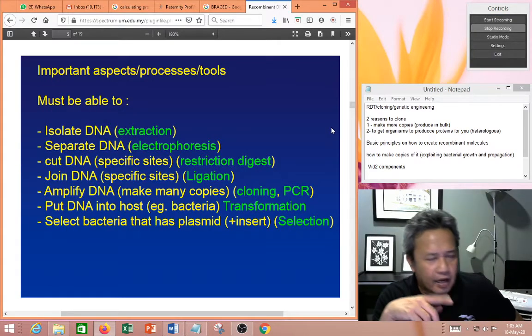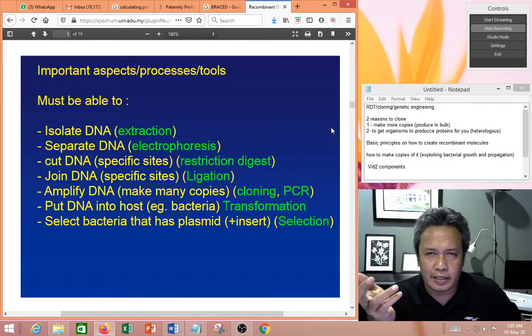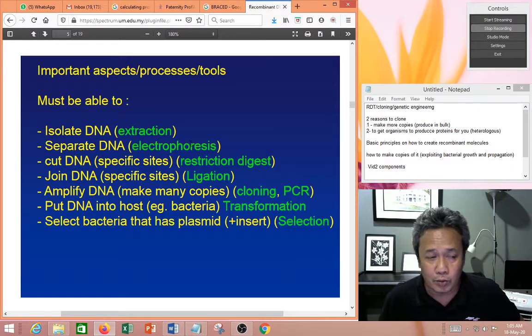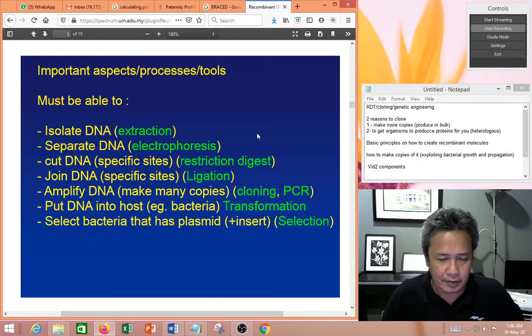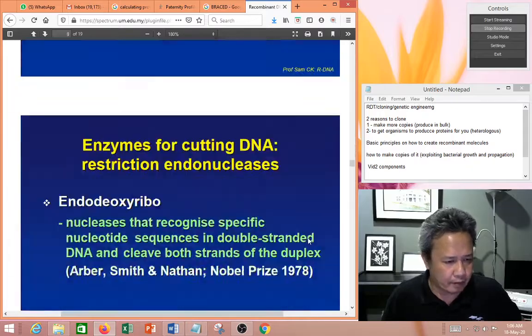Hello again. If you're doing molecular genetics or cloning, you'll find that you cannot run away from doing electrophoresis, right? This is what you do when you want to separate your DNA fragments. Now, electrophoresis, how is it done?